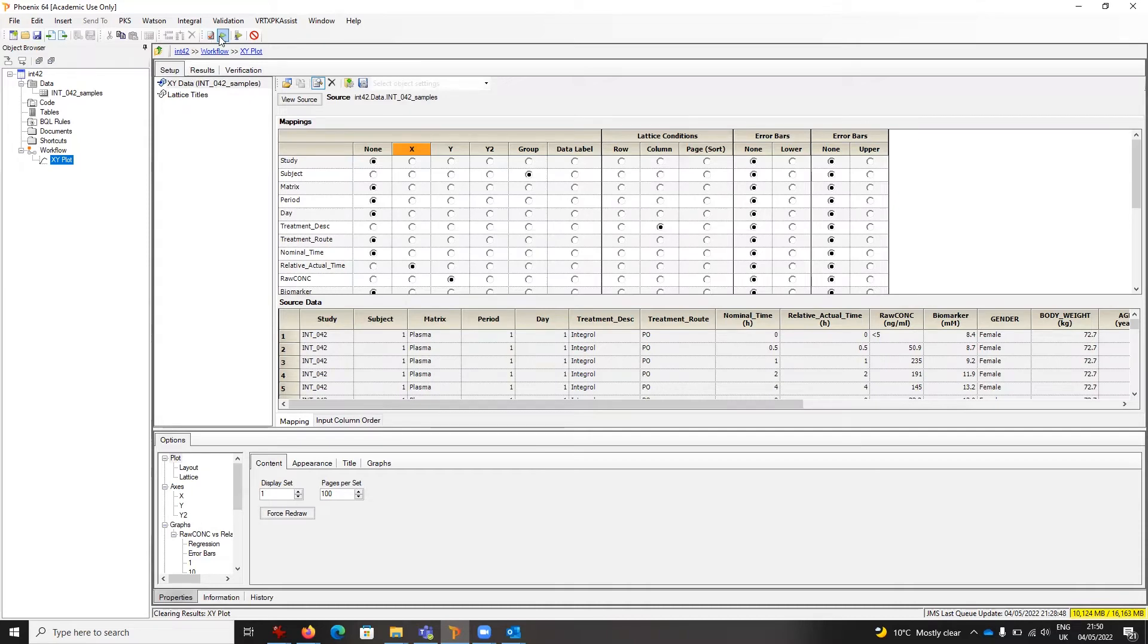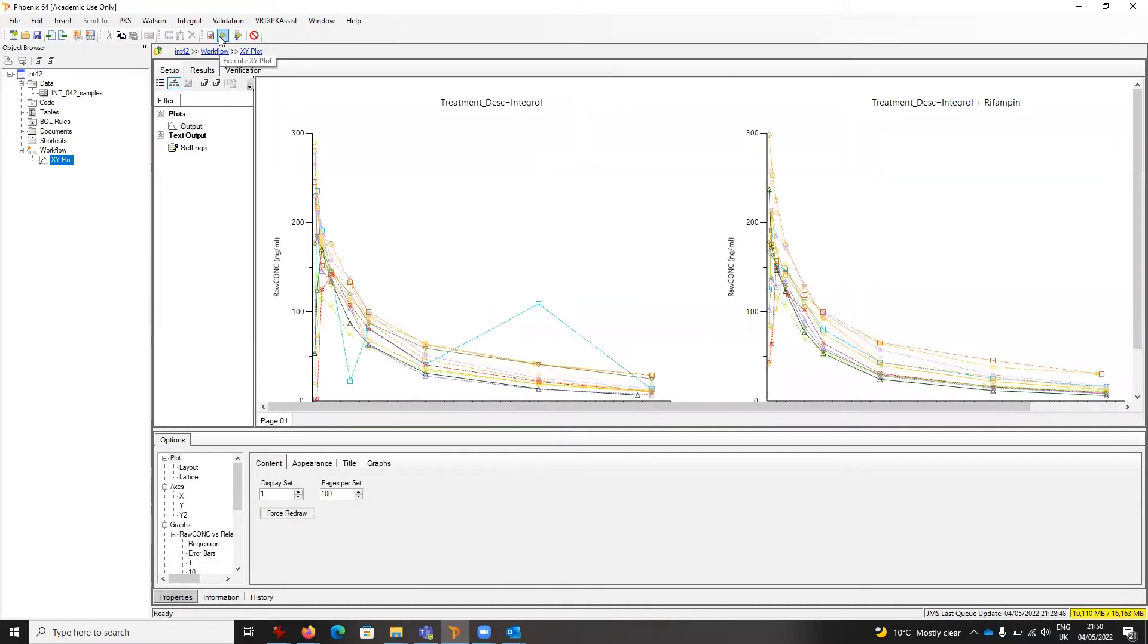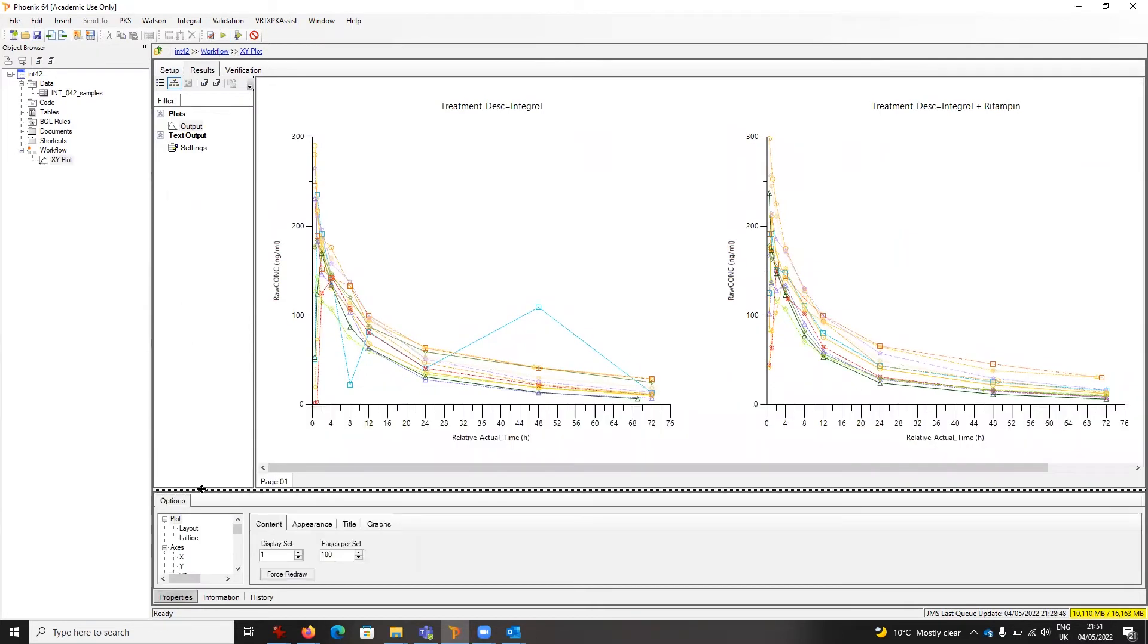Now I see the two plots side by side. They're slightly larger and we have an X-axis scaled to have tick marks at every four hours. Those settings can be applied again and again.